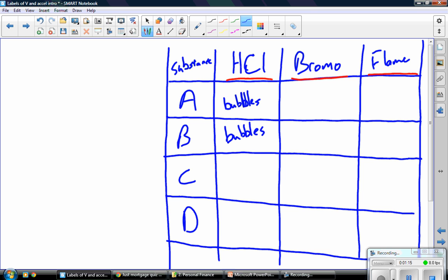What about with C? Was there any reaction? It did get hot. Was there any significant bubbles? No, not really, but it did get hot, so there was heat. Heat formed without a heat source, and it was significant. All right? And what about with D? Cloudy. Any significant bubbles? No? Little air bubbles? Okay, good.